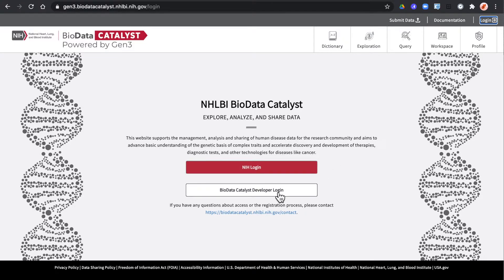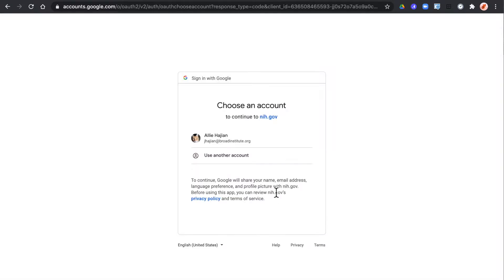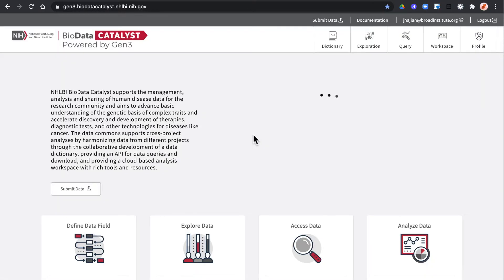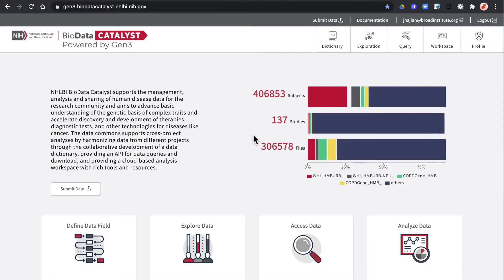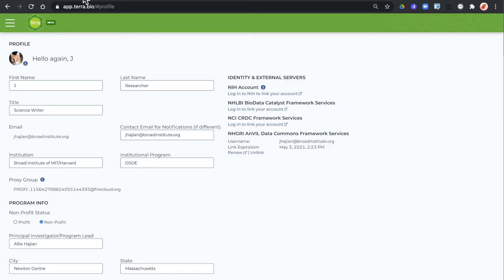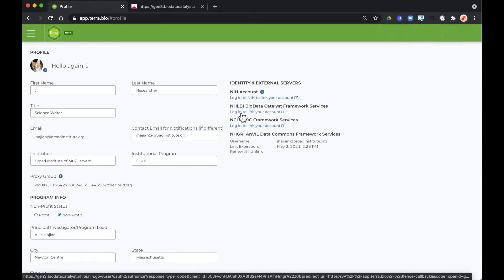I'm a developer so I'll use my BDC developer login. Once you're logged into Gen3 you can go back to your Terra profile and click the link in the identity and external servers to link your account.